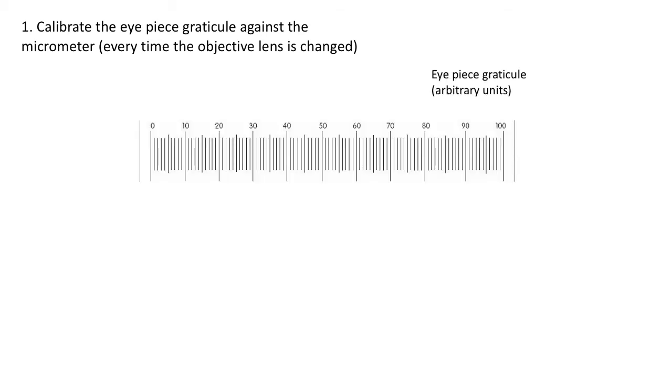When you look down the objective lens, you will always be able to see the graticule. What you want to do is move the slide around until you can position the micrometer on the slide next to the eyepiece graticule. In this example, you can see the stage micrometer is positioned next to the eyepiece graticule.